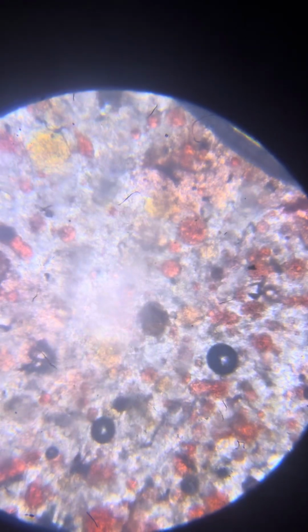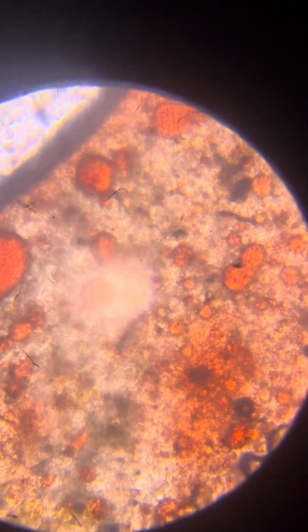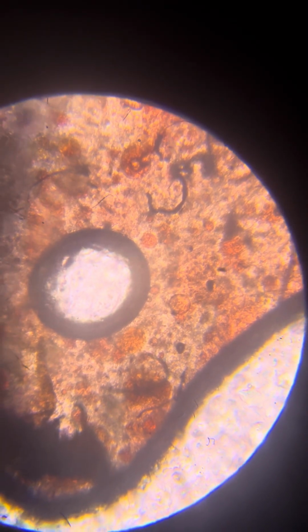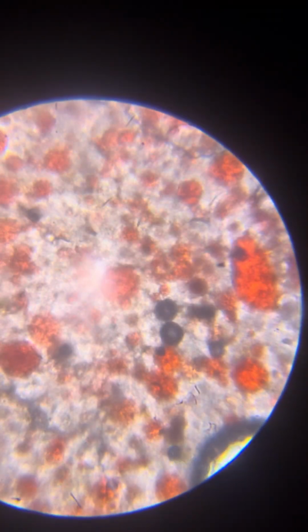I've also added Silan before the last lighting, before the last two. It was used in the past in mixtures when I wanted to create life forms, because I've seen that it gave good results, better than adding sugar. You can add just white sugar, but Silan is a date extract that is not processed, 100% Majhul, and it was proven to be more successful than sugar when you want to create life forms. So we'll add a little bit more Silan, and we'll go for the train bacteria.